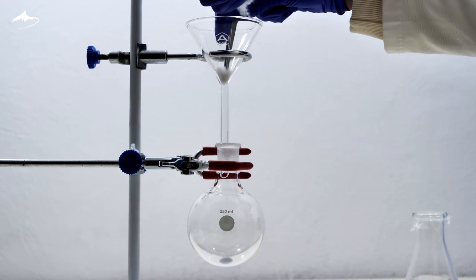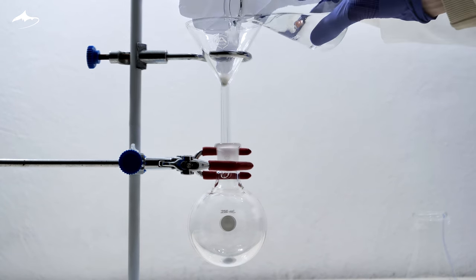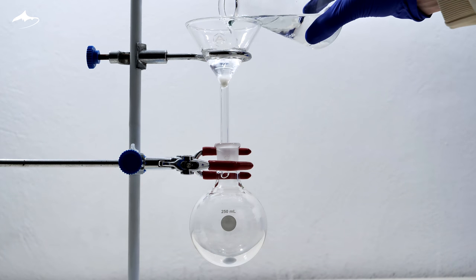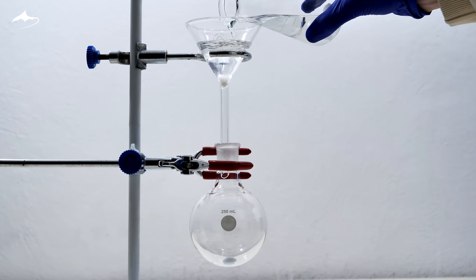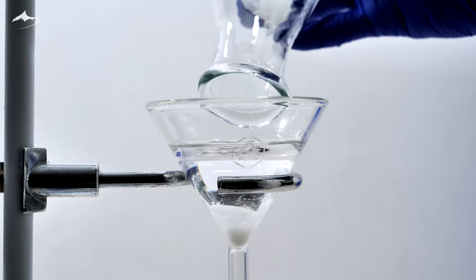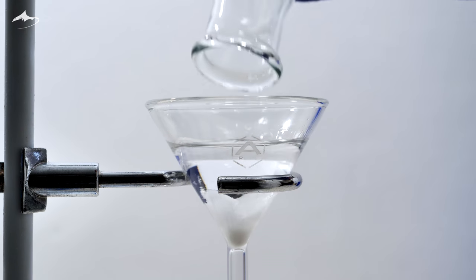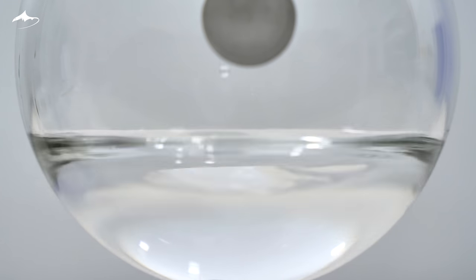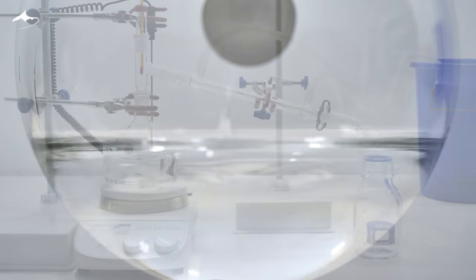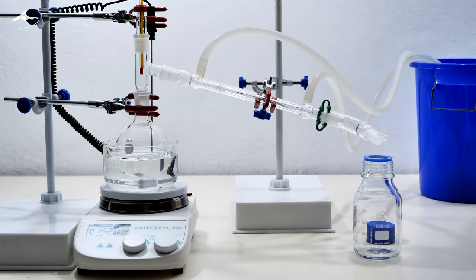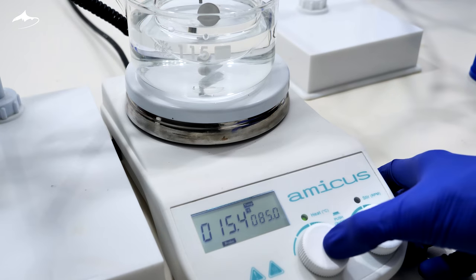This time, a small cotton plug is used instead of paper to prevent too much solvent remaining in the filter, as the product is quite smelly. Then, the ethyl acetate is removed with distillation using a water bath first.